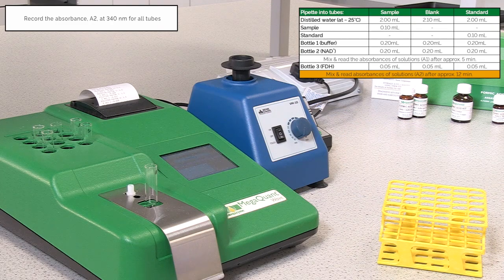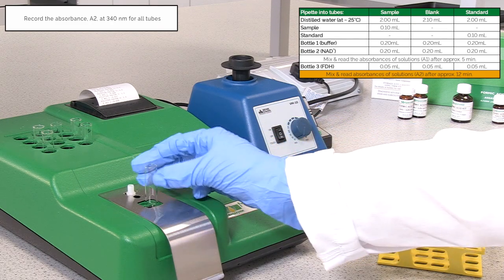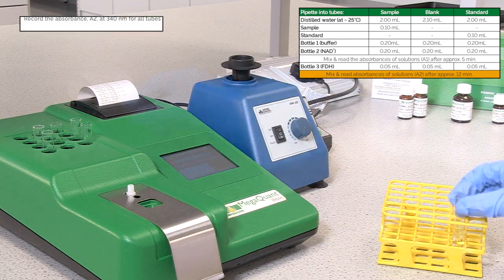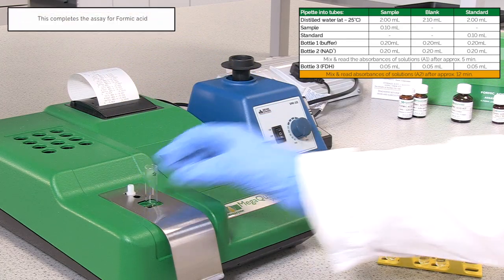Record the absorbance reading A2 for all of the assay tubes. The absorbance reading completes the measurement of formic acid.